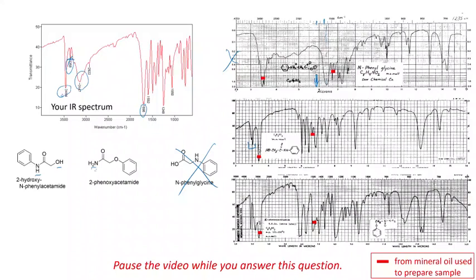Okay, well that's a little tricky here because of our scale in micron. So instead, let's just take little chunks of this and see if we see a pattern of 4 peaks getting smaller and smaller and smaller. Certainly in this side, we have 4 peaks, possibly there. And here we have 4 peaks, possibly there.